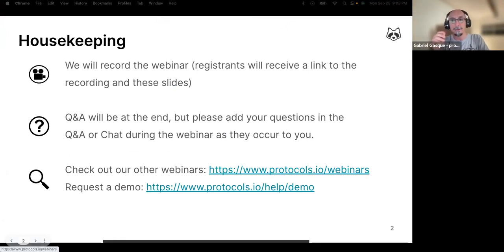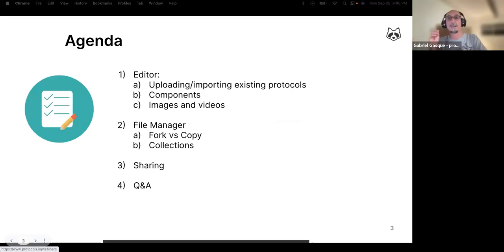Because this is not an introduction webinar, we are going to be highlighting some features that, even though the platform is intuitive, might take a couple of months before you encounter them, and could be very useful from the beginning. So I'm going to focus on some of these things about the editor that are not necessarily very easily discoverable.